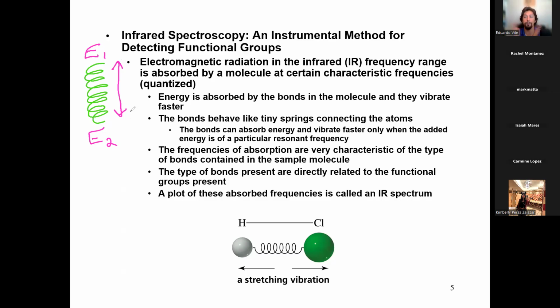They are always moving around, right? We always see pictures of molecules. We always see the models. They're just standing still. But in real life, everything is constantly vibrating and moving around. So yes, the hippies were right. It's all about the vibrations. Everything is vibrating. Everything has a natural frequency.